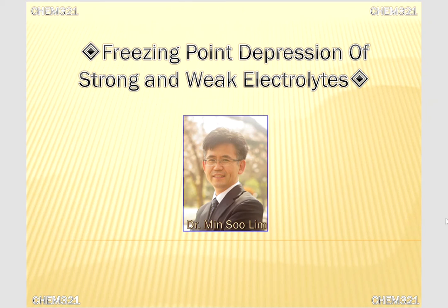I am Dr. Min Soo Lim, and I will show you how to carry out the lab in the experimental and theoretical aspects. You will do a 2-week-long experiment titled Freezing Point Depression of Strong and Weak Electrolytes. I want you to follow my instruction thoroughly, slide by slide.